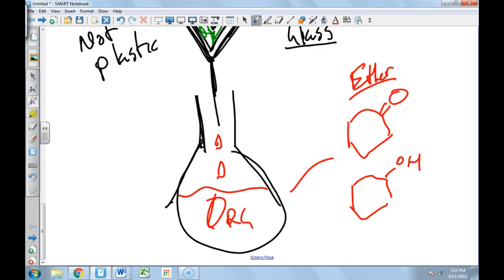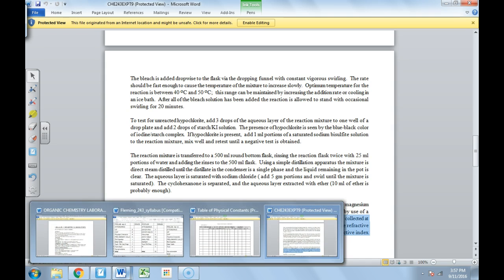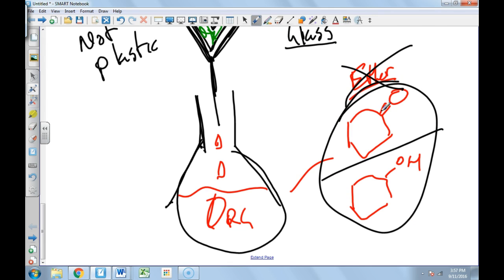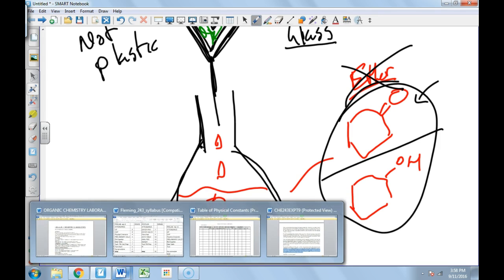So in this lab, we're going to use the rotovaps, okay? Instead of doing this, for this lab we're not going to do another distillation. What we're going to do is a rotary evaporation using the rotovaps in the lab. That is going to get rid of the ether, so the ether isn't going to be there, and you're primarily going to have this left, okay? And so you're going to rotovap it, and that's going to be kind of the end of the procedural lab.